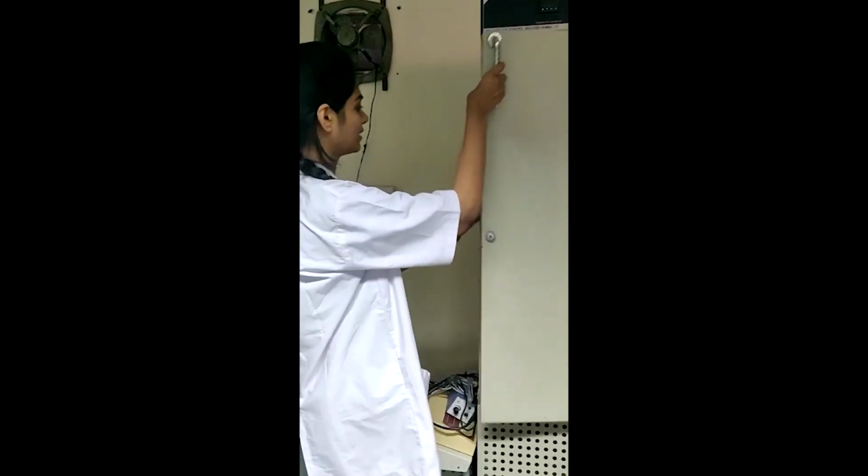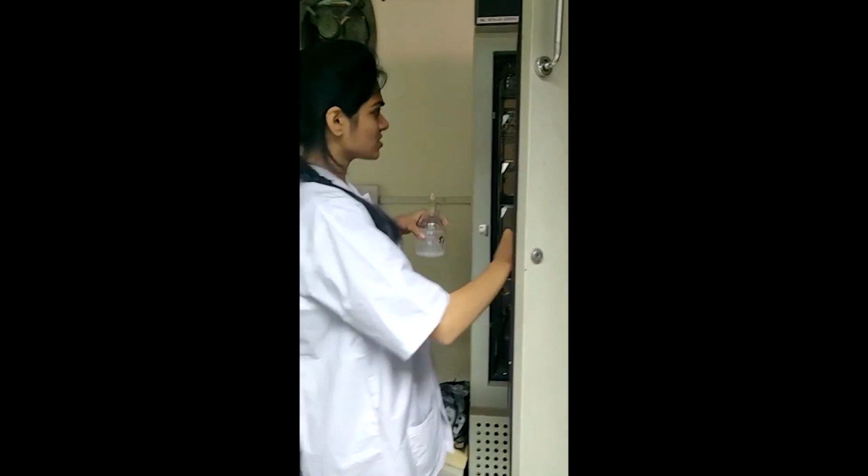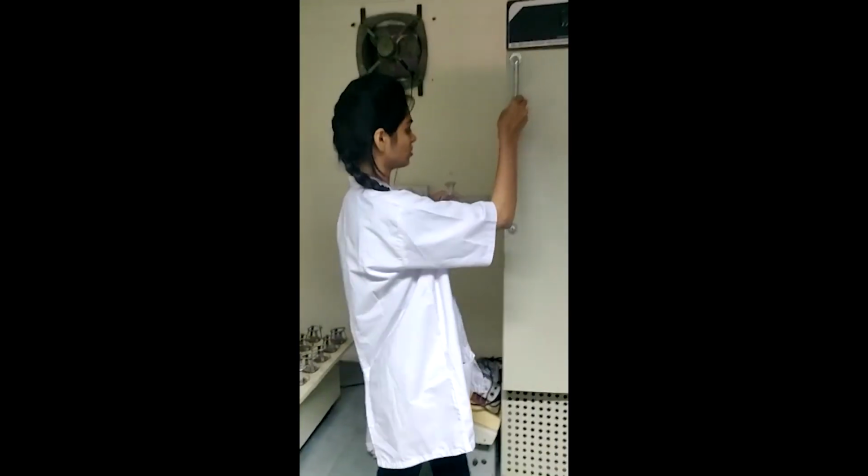We kept it in the incubator for 30 minutes. Now after 30 minutes, we'll take out the BOD bottles. We'll take a sample of this and we'll perform residual chlorine and COD experiments on it in the way we did it in the first semester. After that, the readings were noted.